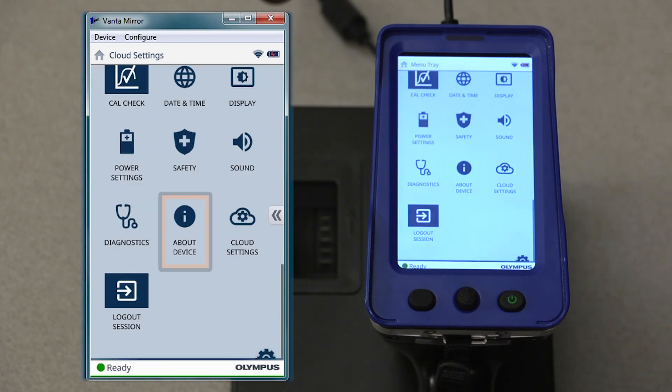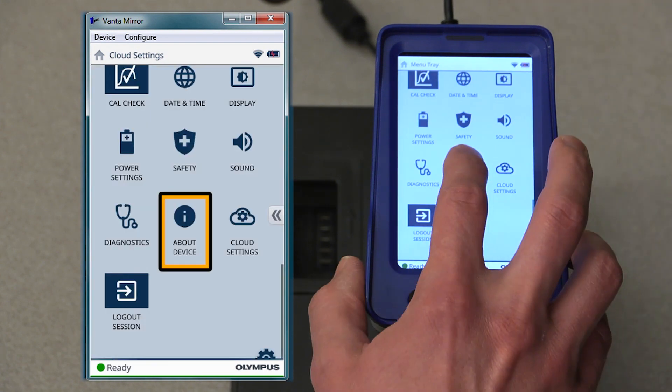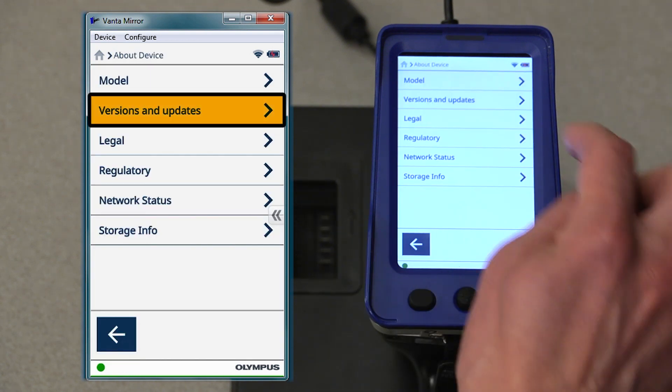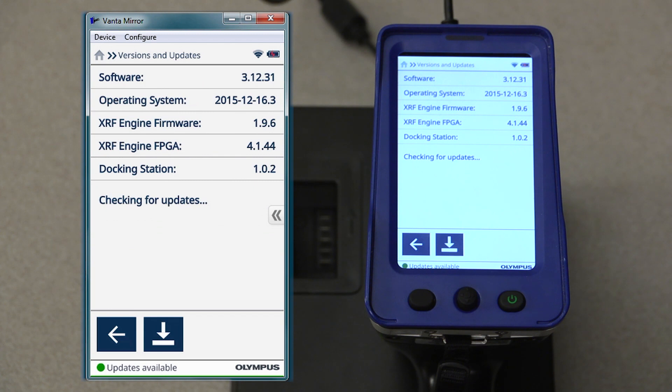After that, we'll return to the menu tray and select About Device. In this menu, we'll select Versions and Updates. And then on this screen, if any updates are available, they will display on this screen.